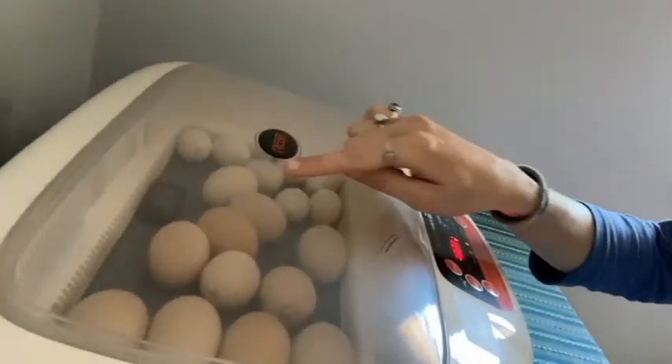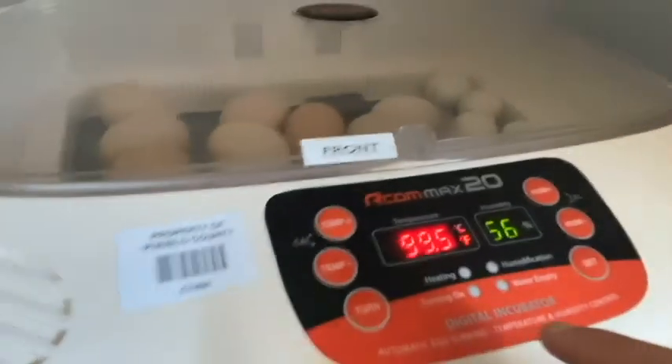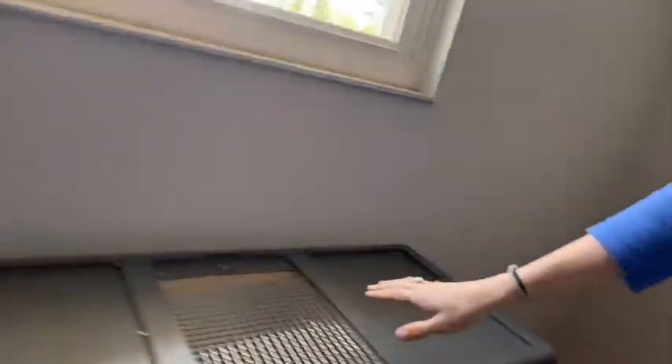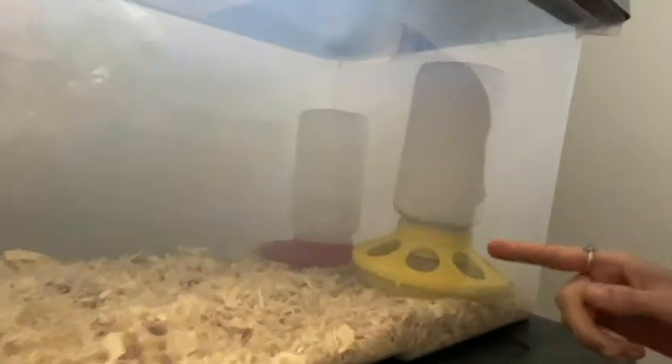Hey everybody, we've made it to day 18. On this day, we have taken out the slats that used to be in there, and we've also turned off the turning function on our incubator. On day 18, the chicks are turning around in the shell and starting to poke their little egg tooth — which is on the end of their nose — into the air cell. They get that deep breath of air, and then they start hatching. It'll be just a couple more days and we will have chicks — hopefully, cross your fingers! We also set up the brooder, which is where the chicks live after they hatch. We have a heater, chicken feed, water, and a nice comfy cozy bed of pine shavings — but no chicks in there yet. It's starting to get exciting!